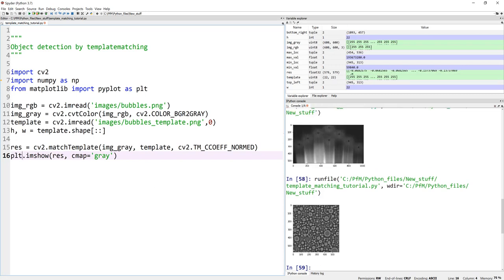And I'm matching the template like usual. And let's go ahead and show the probabilities. There you go. This image has a whole bunch of bubbles. And I picked one of these bubbles as my template. I want the image to show all the other regions, other bubbles that match this bubble.